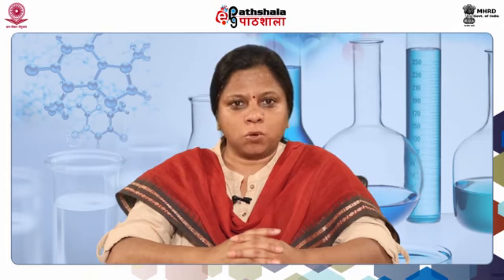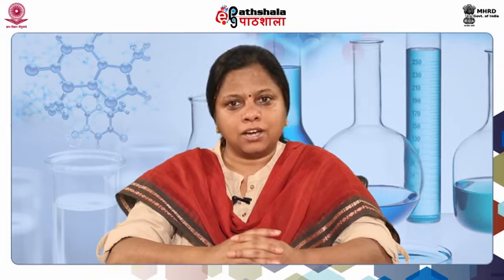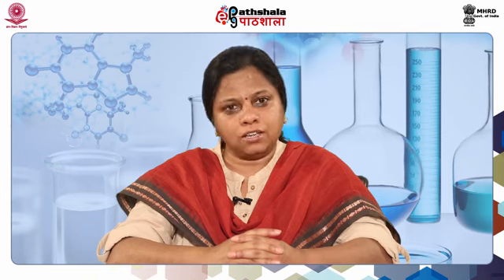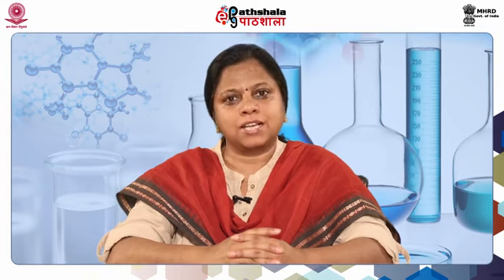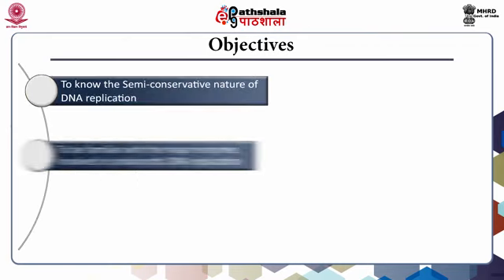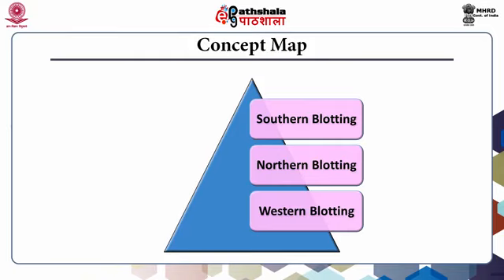There are three types of blotting: Northern, Southern and Western. I would like to mention here that hybridization and microarray are based on a similar principle. The difference is that in hybridization, the probe is added after binding of DNA or RNA to the membrane, whereas in the microarray, probes are added to the glass slide first and samples are added later. Blotting or hybridization is of three types: Northern, Western and Southern.